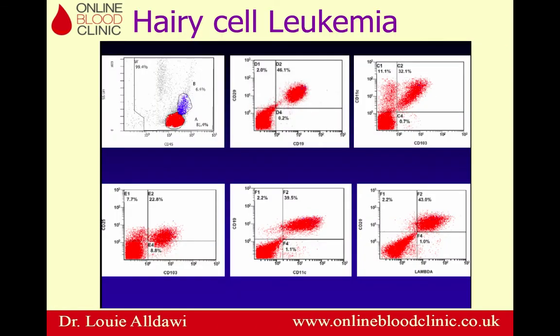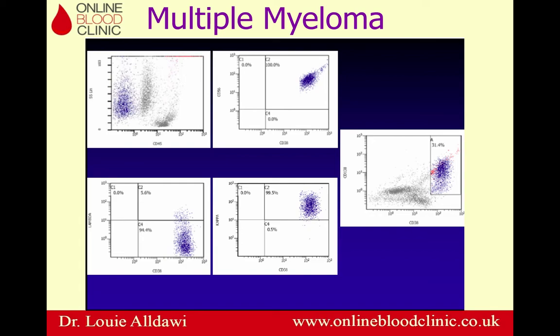To diagnose hairy cell leukemia using flow cytometry, the first slide (top left) shows the CD45-low population of interest. After gating, further analysis shows the cells are CD19 positive, CD20 positive, CD11c positive, CD103 positive, CD25 positive — and they are lambda restricted, which is very characteristic of hairy cell leukemia.